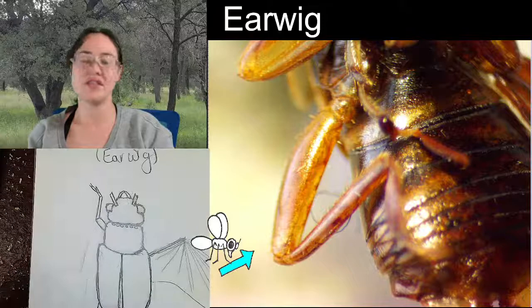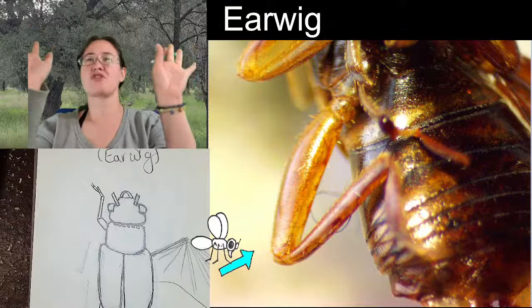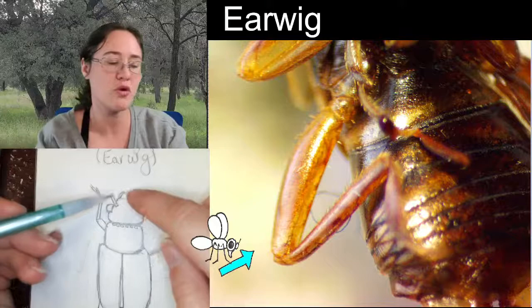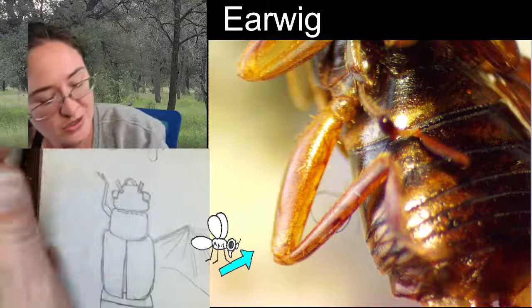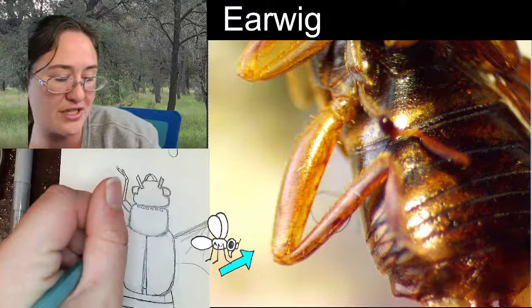All right, and I think yeah, that'll work. On the front legs, you can put the pad towards the body because they're on the underneath, and a lot of times insects are standing like this, so you would see the pad towards the head. But on the hind legs, you're going to see the pad towards the body. So I'll go ahead and show you that too. My second pair of legs is not going to be coming out of the pronotum. It's going to be coming out what looks like right underneath the beginning of the tegmina. The femur comes up. The tibia comes back.